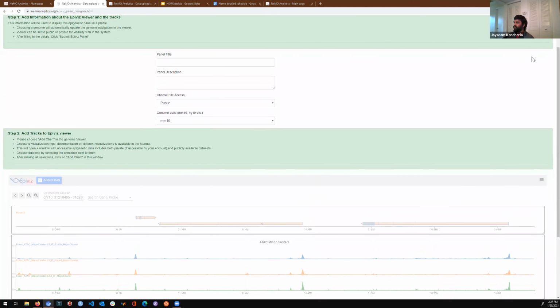And hopefully everyone's at that screen. As Brian was showing before, you can then go to a profile. Since I'm running out of time, you can go to a profile and then look for this panel, add this panel to a profile and look at data.